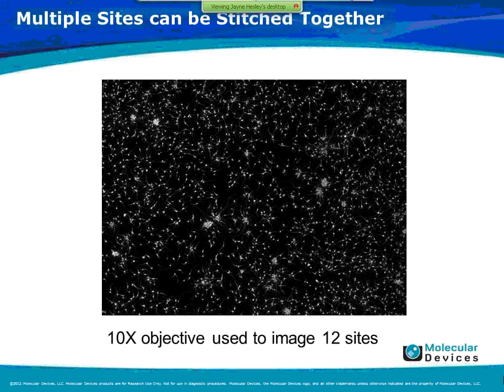Another thing we can show is that if you image your cells and you really want to follow the neurites, they're very long, and you want to measure the ones that would maybe go out of a field of view, you can capture multiple fields of view and stitch them together into a large image.